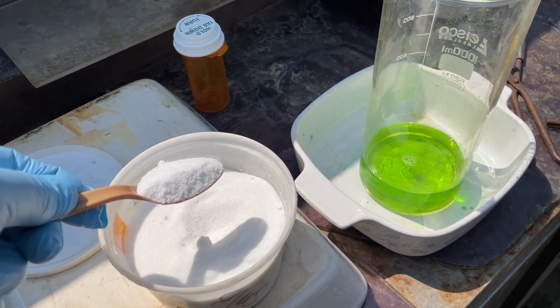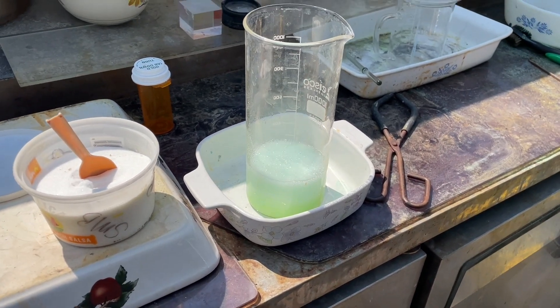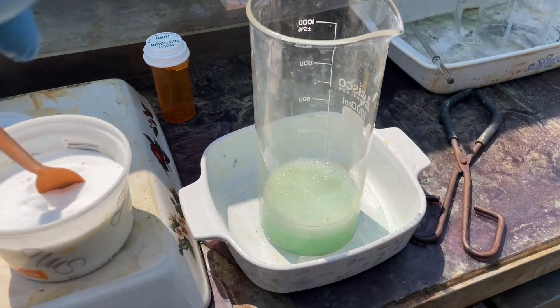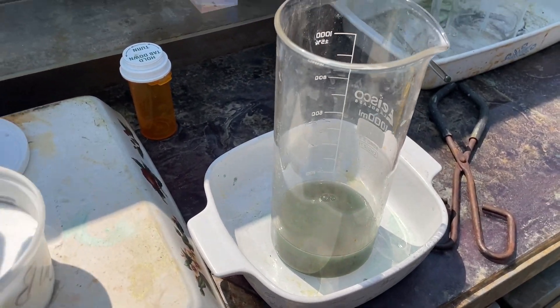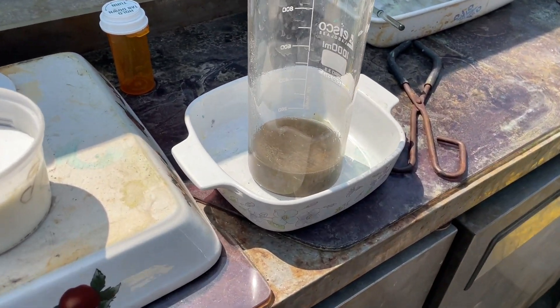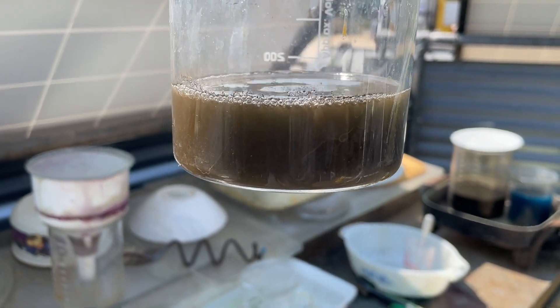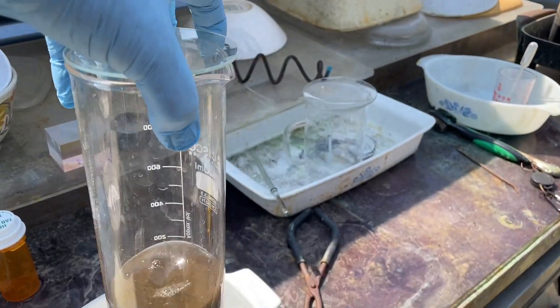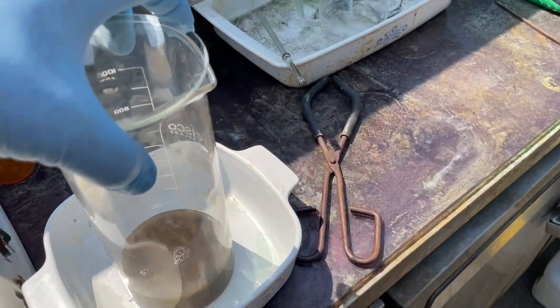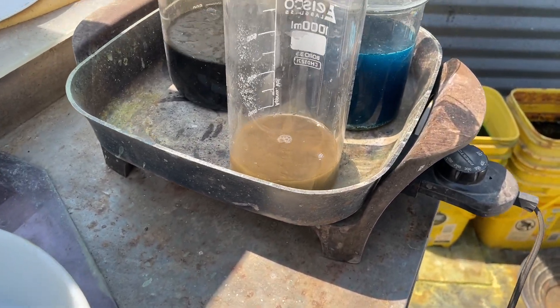Got some sodium metabisulfate here. We'll put in a nice big scoop. Yeah that should get her done just like that. Put a lid on it. Oh look at that go — holy smoke! Blasted out of solution — look at that. Yeah I'm sure that's plenty. I'll stick it up on the heat here for a few minutes and then we will take a look at it and see what we get.